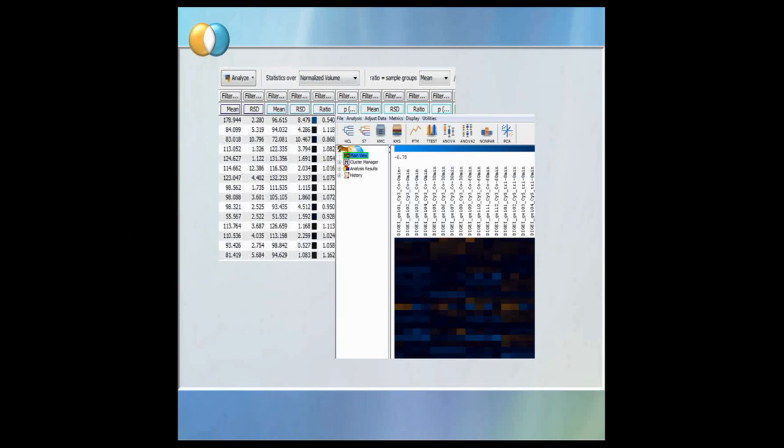This is how quantitative analysis in Delta2D looks at the beginning. You get data in two ways. One is the quantitation table that includes data across the complete experiment. That means for all the gel images and all the spots. And there you already have access to, for example, standard deviation within certain groups, the ratio between groups, the p-value for the t-test of a group pair.